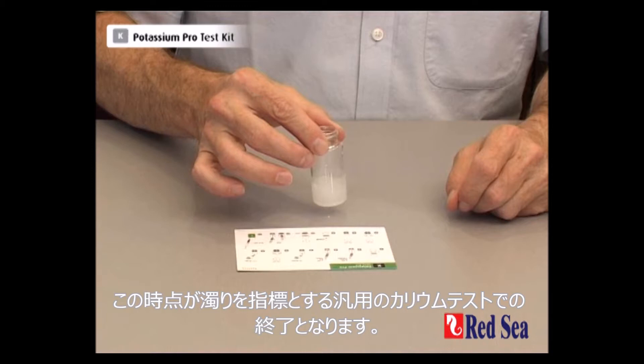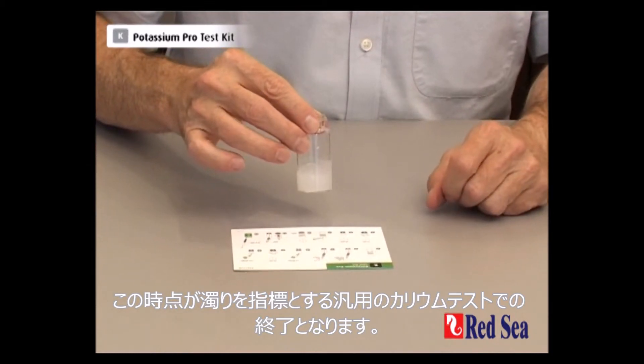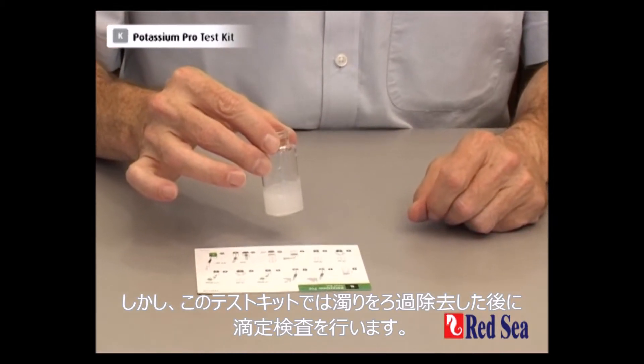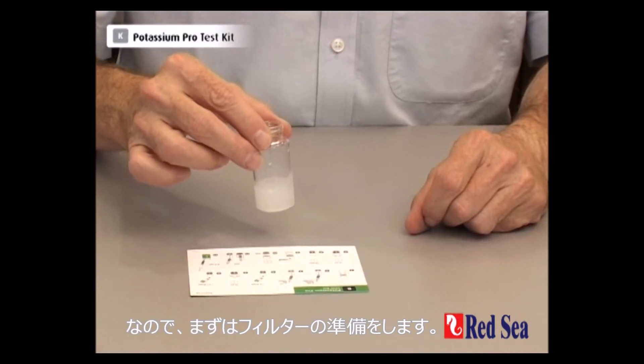This is normally the end of most potassium test kits because they are based on turbidity. But this system filters out the turbidity after the reaction and then we're going to do a titration. So the first thing we have to do is prepare our filter.